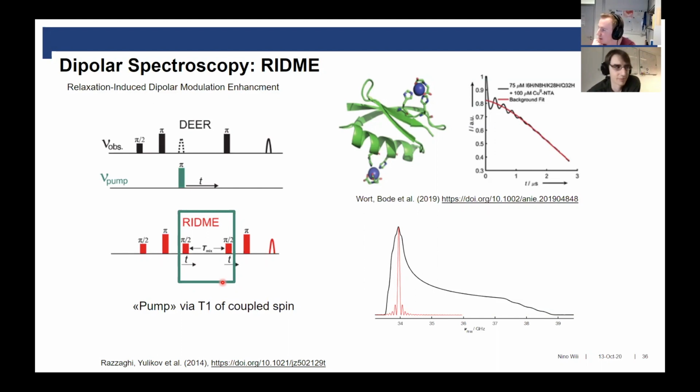Well, I mean, I don't know why people don't do it. I think the EPR labs I know that do dipolar spectroscopy in biology, many of them actually use NMR as well. So I think it's mostly a question that there are not so many EPR people doing this at all. So I think there's actually a manpower problem in all of this, but I don't really know. I mean, we do, so I cannot say it from our part. Yeah, but I guess education about EPR and having EPR spectrometers probably helps.